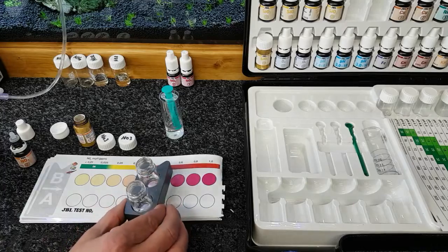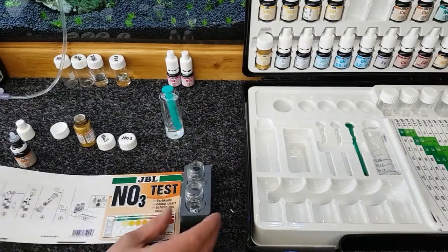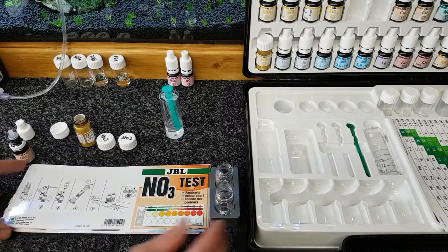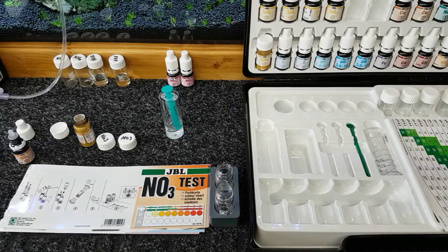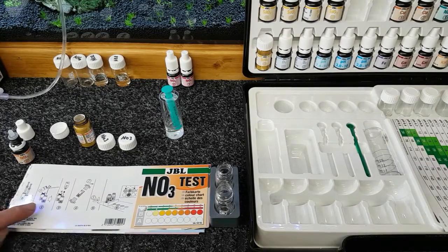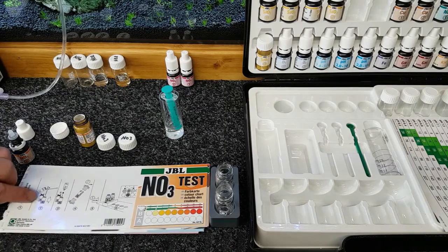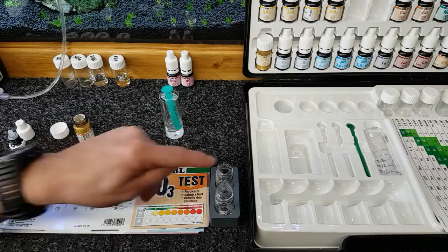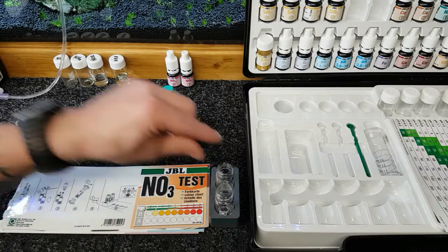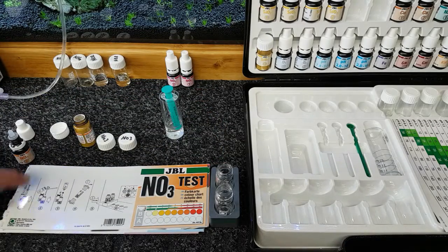Now we want to come off of that one, put those aside, and then over the next page we've got your nitrate test, the NO3. So we look at the syringe again. It's got one syringe on there which is marked with a cross on the top on each one. Now that means that in most of them, you don't put any drops into this one, okay? If you're unfamiliar with that.